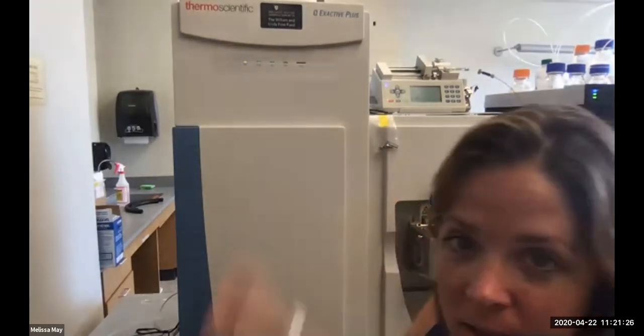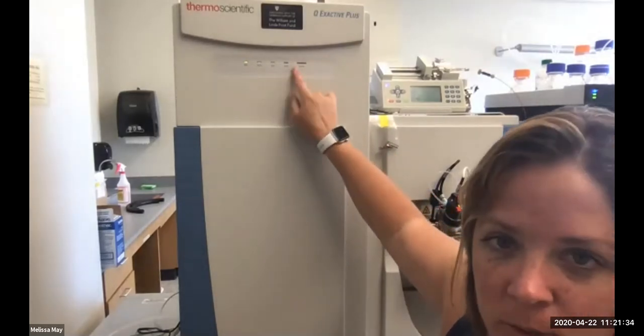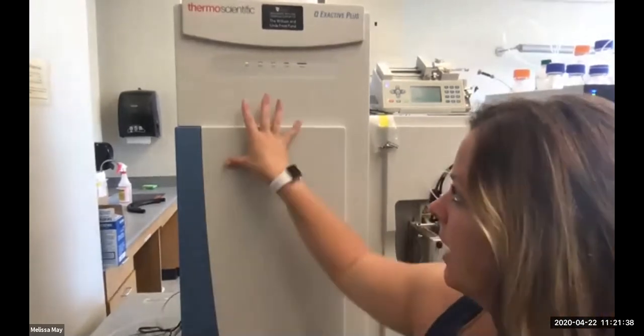Currently, our system light, it's hard to see here, is orange because I have the system in standby. If I turned the instrument on, this would turn to green. And if things were being injected into the instrument, you would see a blue bar coming here telling you that it's scanning. So this is one way for you to see how the instrument is working.